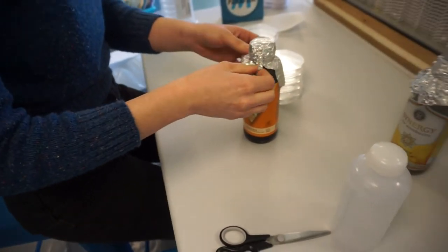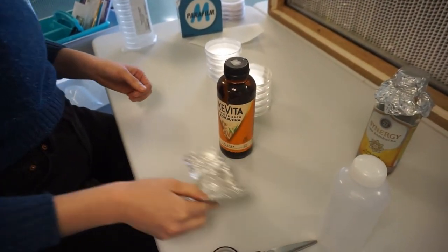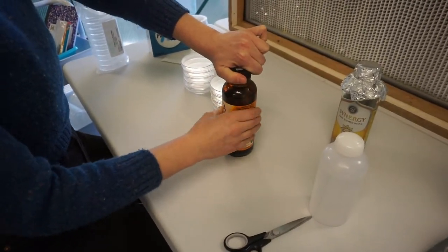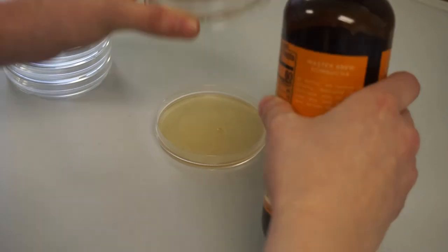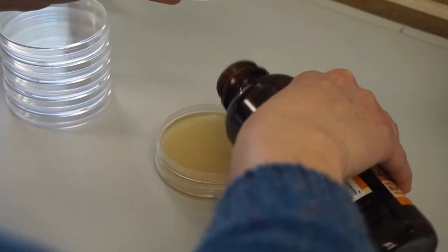In front of the flow hood, remove the tin foil and cap from the glass agar bottle. Moving swiftly but carefully, start pouring your plates. Pour from the bottom of the stack to the top, keeping each plate open for as little time as possible.